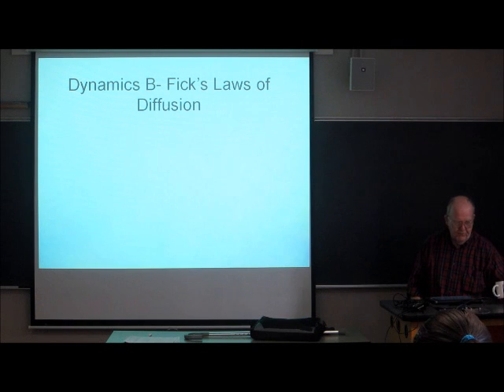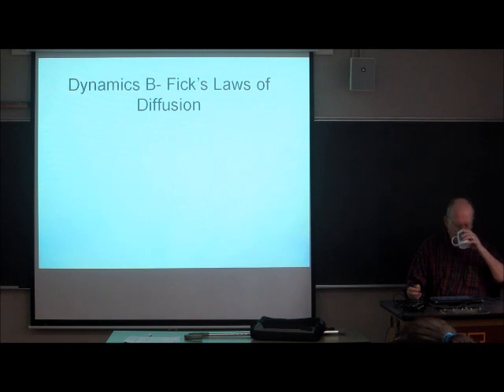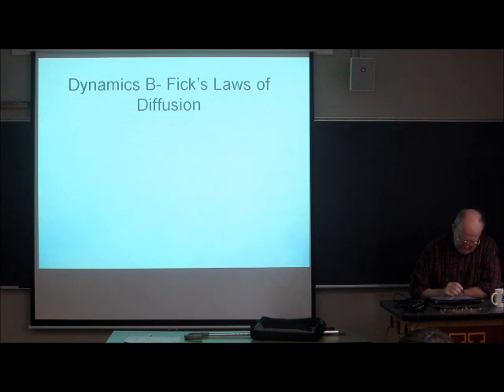Okay, so today we're going to start getting into the details of what is going on inside of the column. And the process of diffusion is terribly, terribly important in chromatography. So we're going to take a good hard look at diffusion in general.